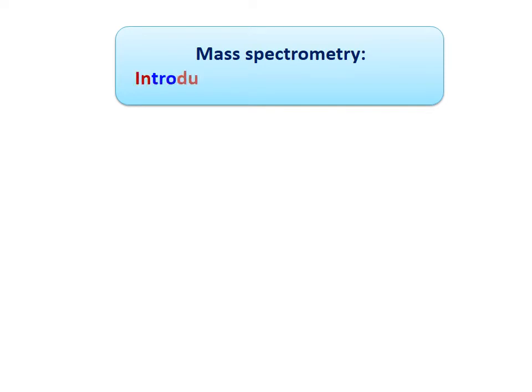We will see here the introduction and instrumentation of mass spectrometry.